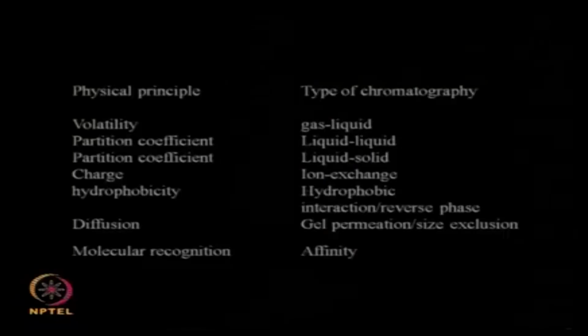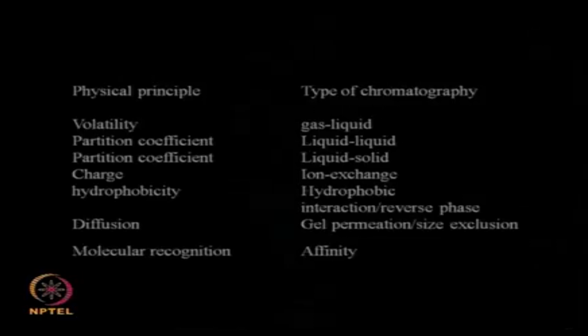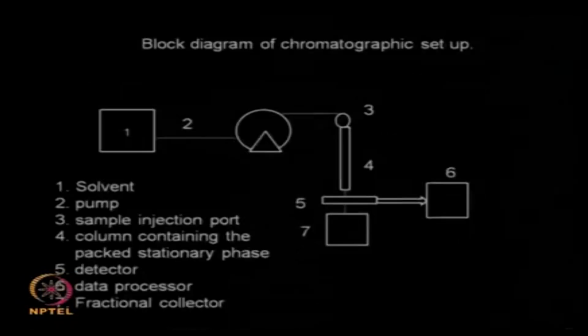So depending upon the principle which you want to follow, depending upon the mixture of proteins you want to separate, we may use different types of chromatographies, and all these chromatographies are already being practiced commercially for purifying biomolecules, biopharmaceutical products, protein and so on actually.